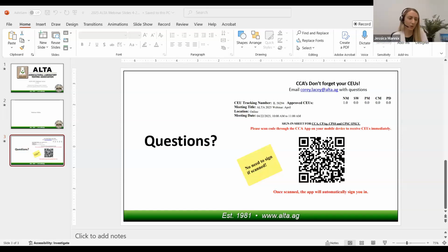Absolutely. So when we're looking at those micro size analyzers and we're prepping our samples in foils or some other type of encapsulation material, especially when we're not working on such a small sample size, we'll usually put them through a manual pressing tool. Basically it's a hand plunger. What that does is it uses force to expel any of the trapped air inside of the sample, which could lead to inflation of nitrogen results. So for solid samples, we'll put it through that plunger to expel any ambient air from being trapped.